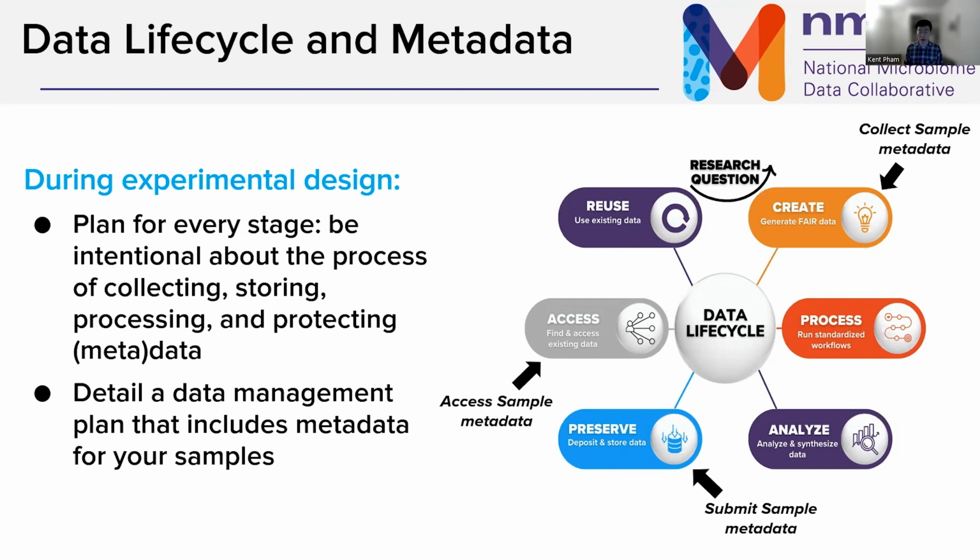Just like how you would create a data management plan, you should have a metadata management plan to make sure that you're not losing anything, and that when it comes time to submit your data set to a repository, you have everything already pre-filled out and you're able to describe every bit of sample data that there is.